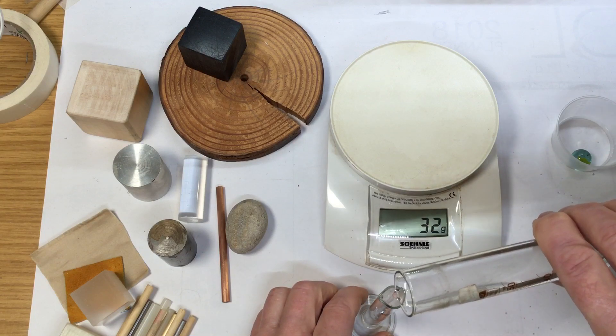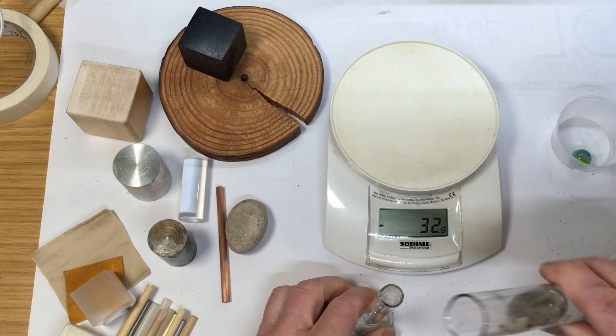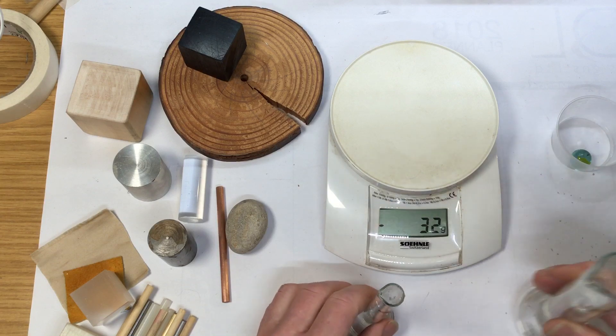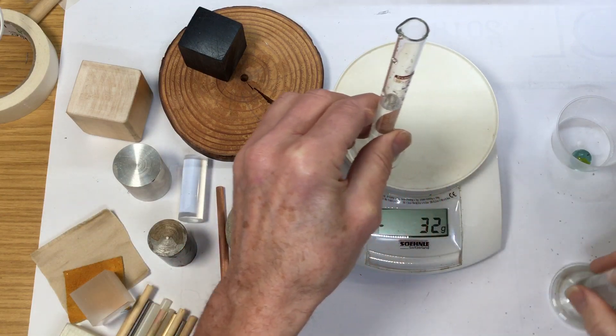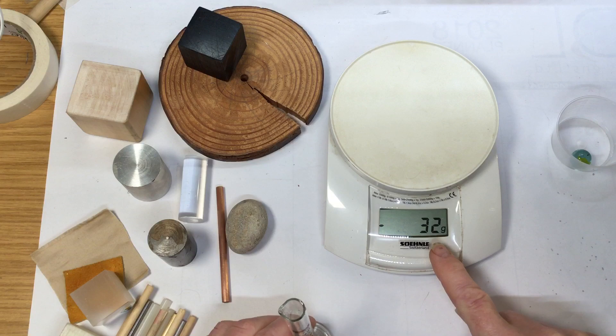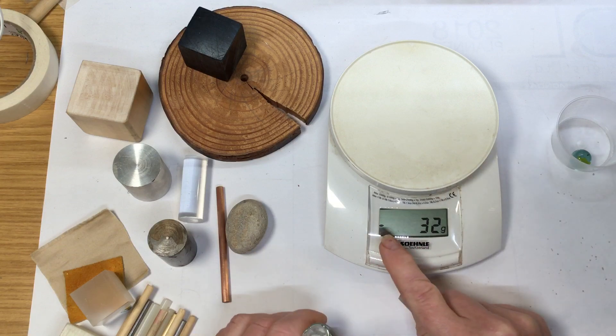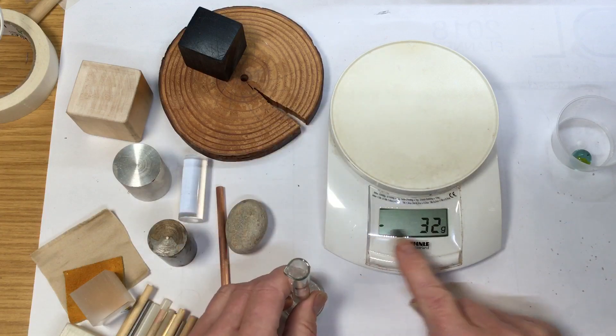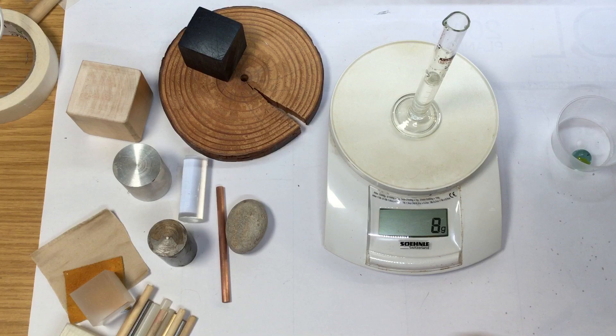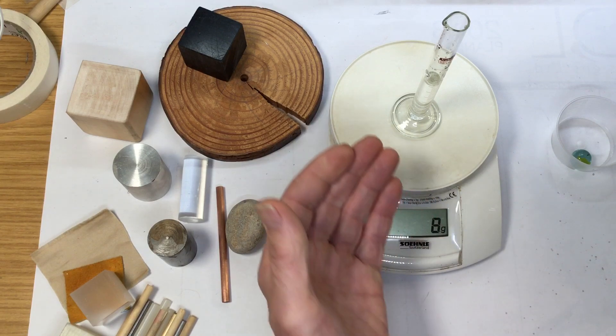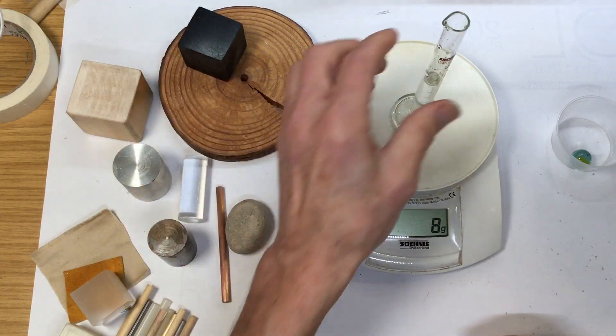I've just measured out seven milliliters there. Now we've got zero - the zero's disappeared because we've taken the container off and it's saying minus 32. Pop it back on, and it says about 8 grams. Well, I don't think that's very accurate.